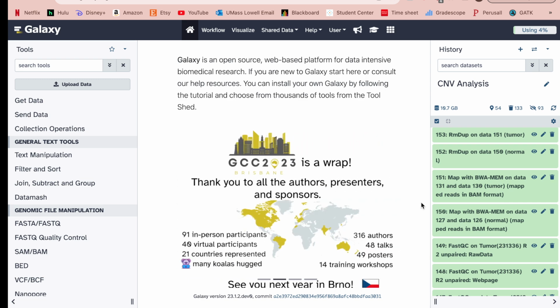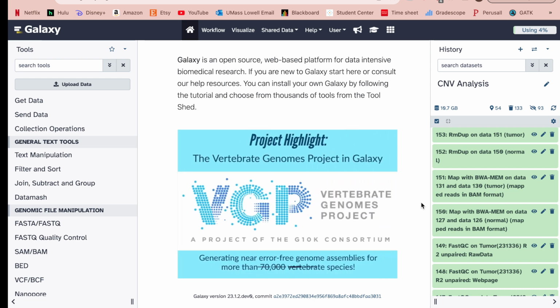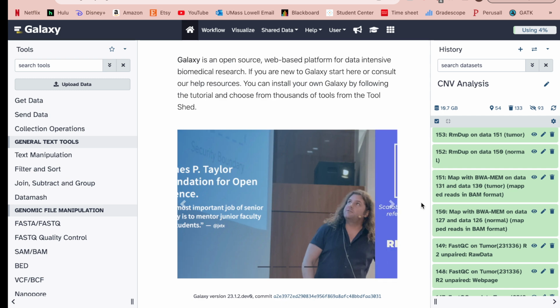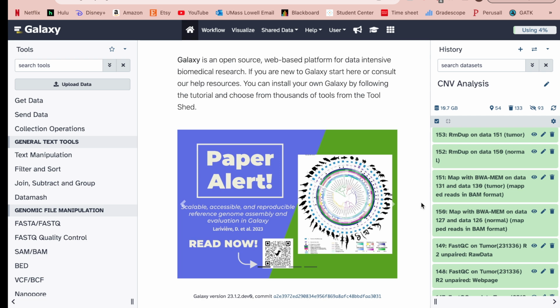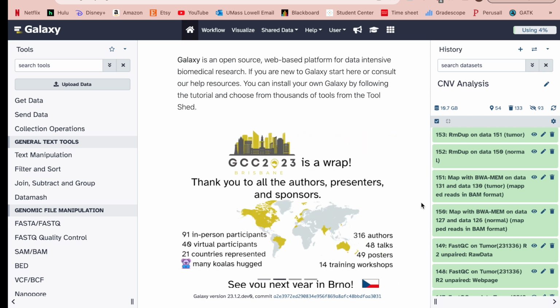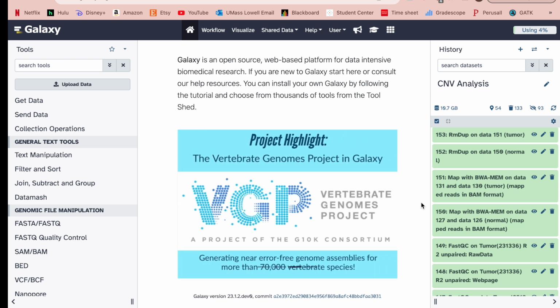The purpose of this project is to create an easy-to-follow tutorial on identifying copy number variations using VarScan on Galaxy. Not everyone has the coding skills to analyze their data using code. Galaxy is an amazing tool that allows anyone to access the tools programmers use to process their data without using any code at all.